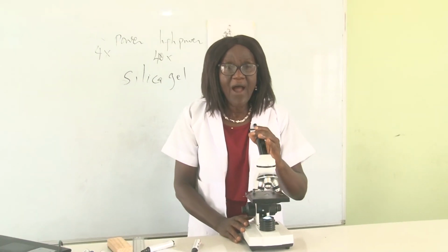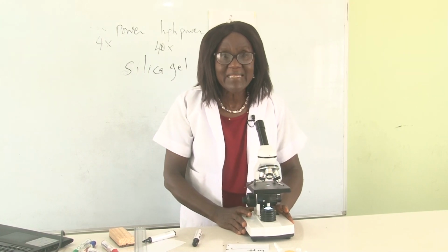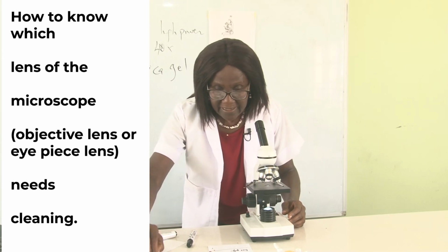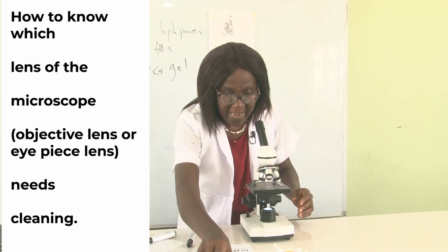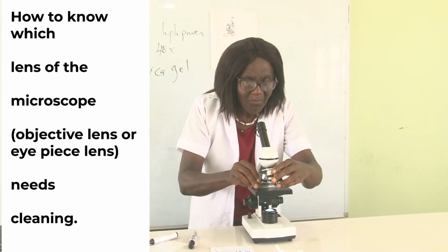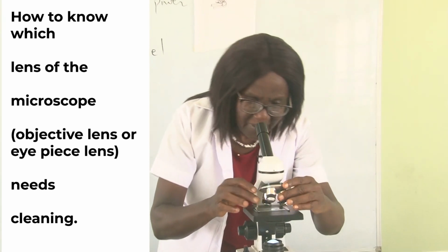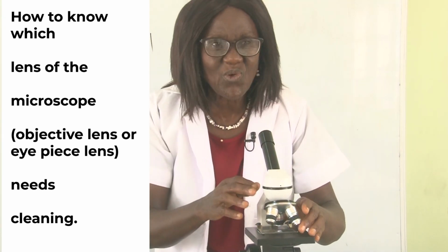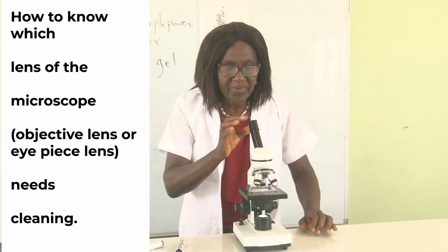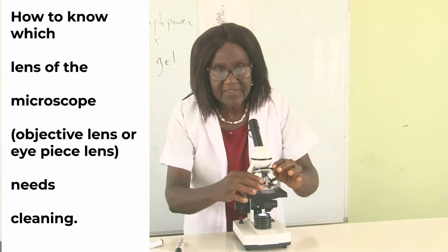Good. Now, how do you know which parts of the microscope to clean? When you are looking at a specimen, you find blotches or dirt on the specimen. How do you know whether the dirt is from the eyepiece or the objective lens?